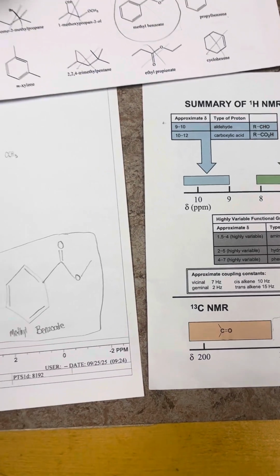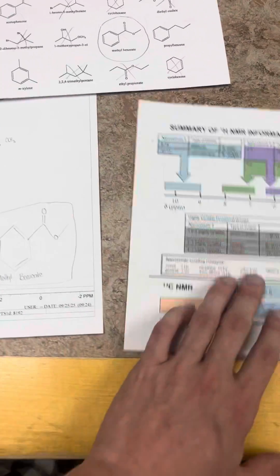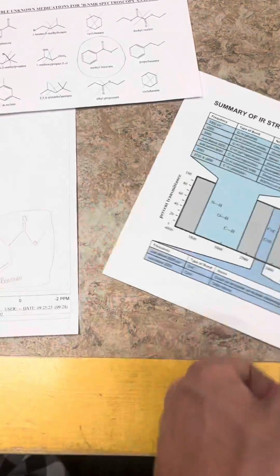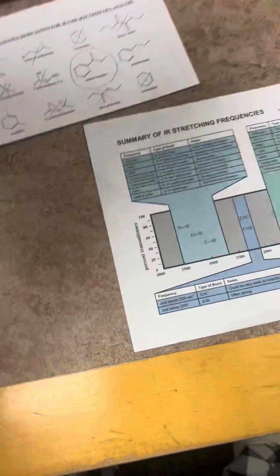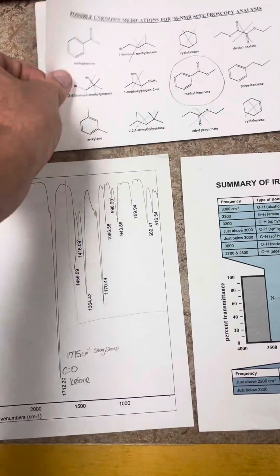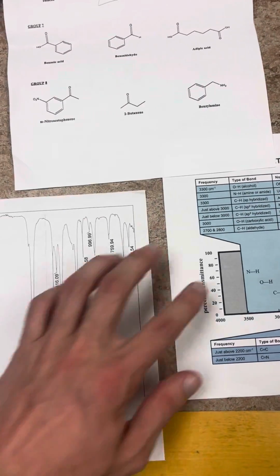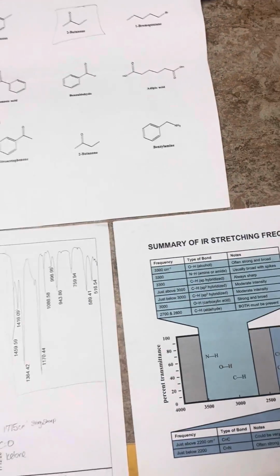Next up, we have our IR spectrum. Alrighty, here we go.